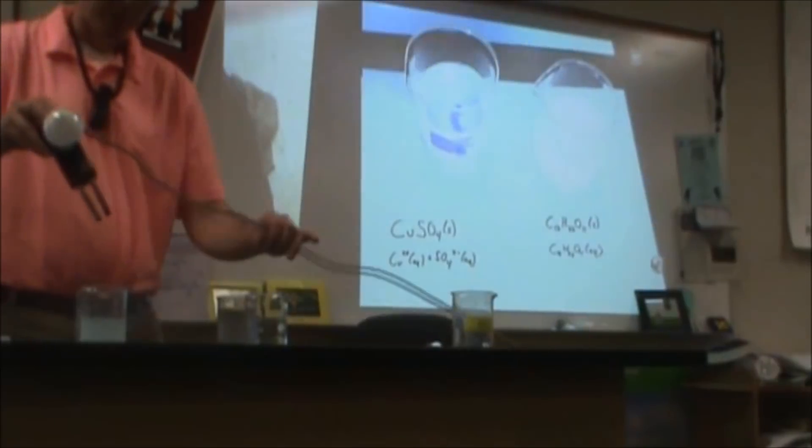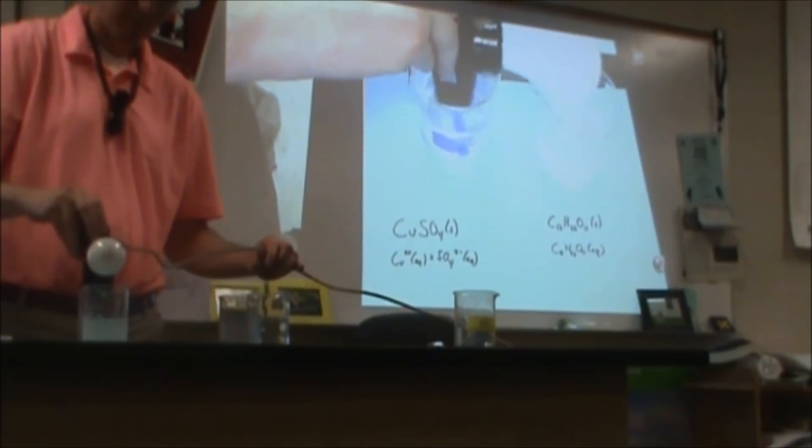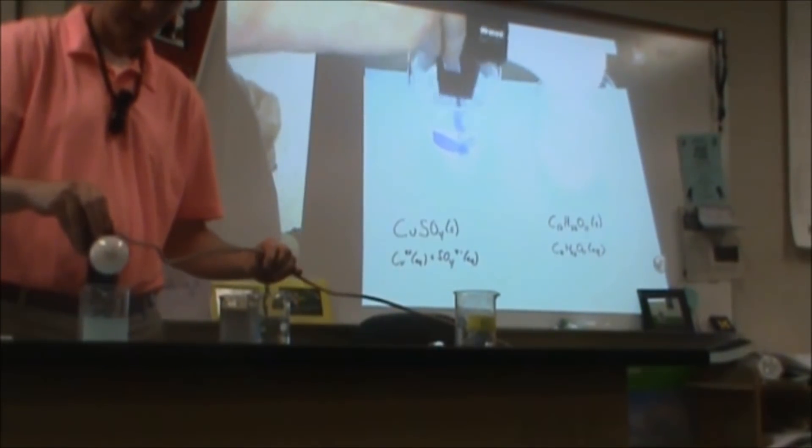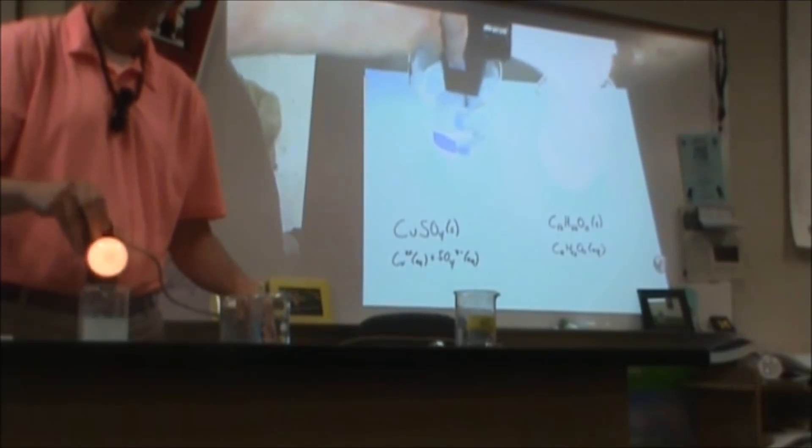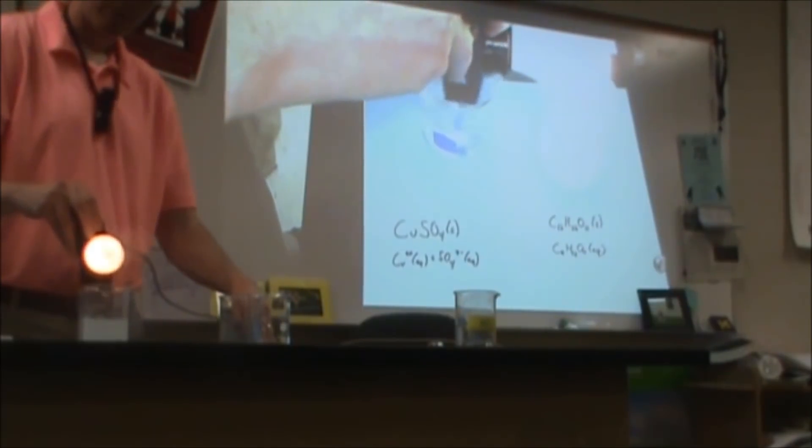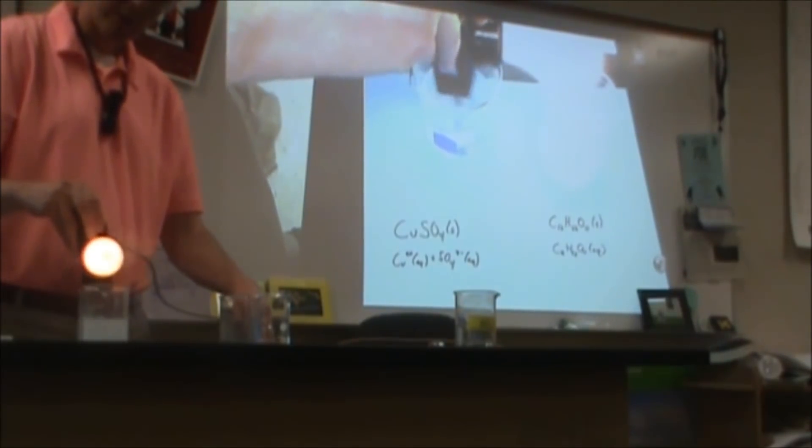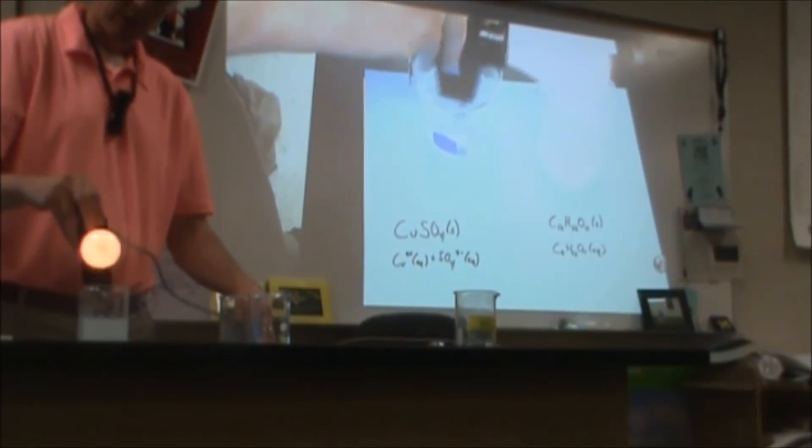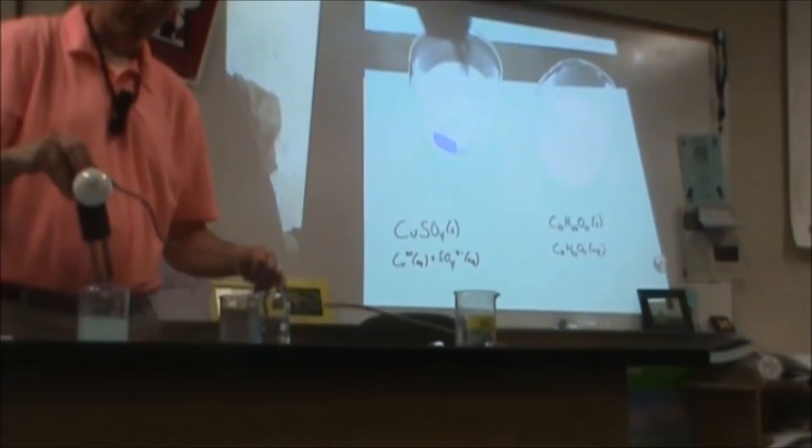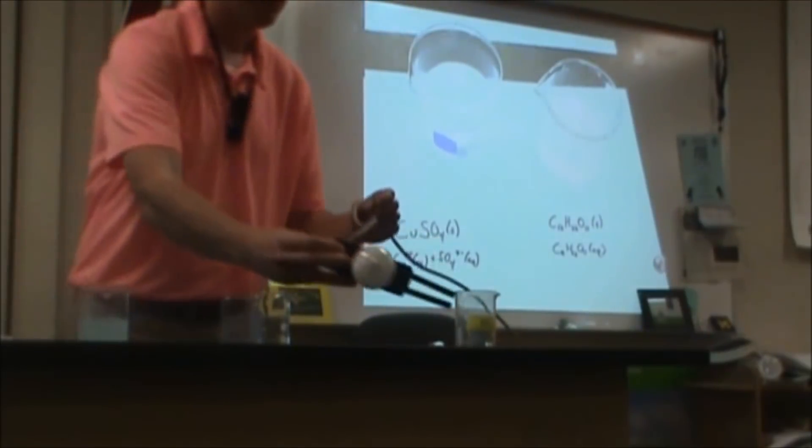Whereas if I take this and put this into this solution, as I stir this, you're going to see that it's going to start to get brighter and brighter, as more and more particles are able to conduct that electricity. We can see that light bulb will start to light up. And as we leave this over time, it's going to get even more bright as it continues to get more of that dissolved in there.